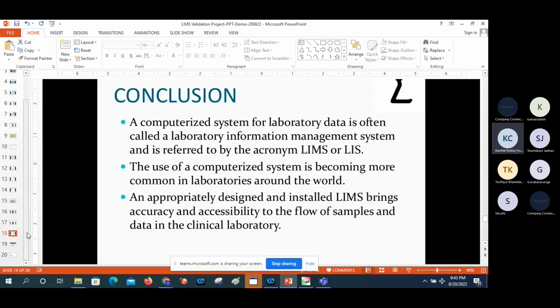For example, lot management is there. How to create the analysis, product, sample plan, item code, this kind of thing. And for example, inventory is there. How to create the inventory for chemicals, reagents, volumetric solutions. And instrument is there. How to create the instrument, and how we can put the dates for that as per the calibration schedule.